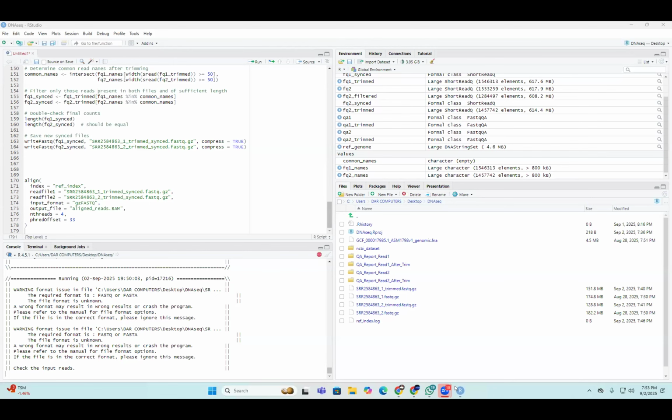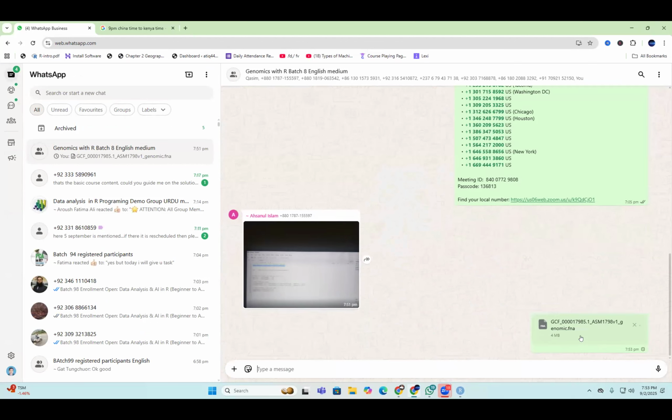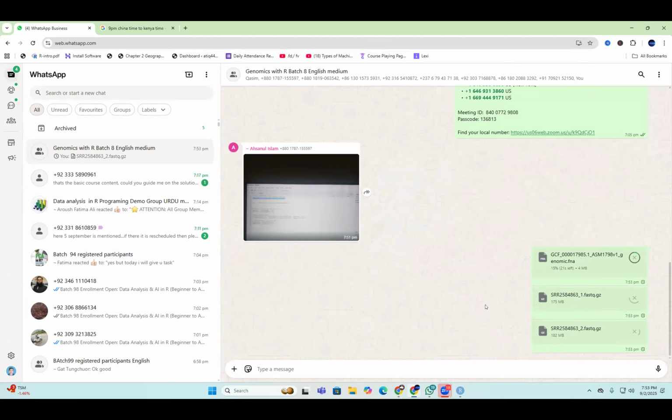I have sent it in the group. It's a big file, it may take time.